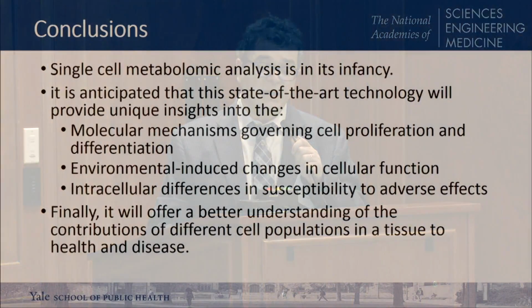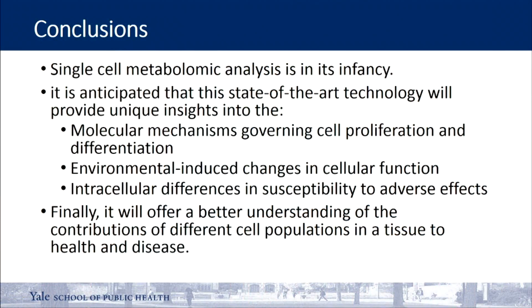So, in conclusion, single-cell metabolomic analysis is in its infancy. It is anticipated that this state-of-the-art technology will provide unique insights into the molecular mechanisms governing cell proliferation and differentiation, especially in the case of stem cells, how from one cell you end up with different cell types.